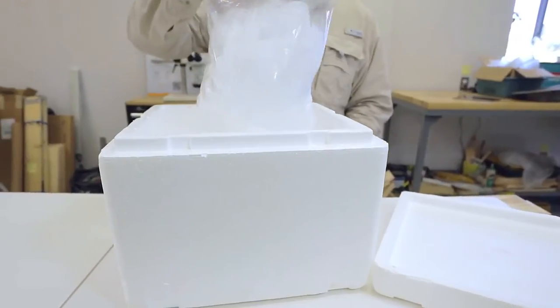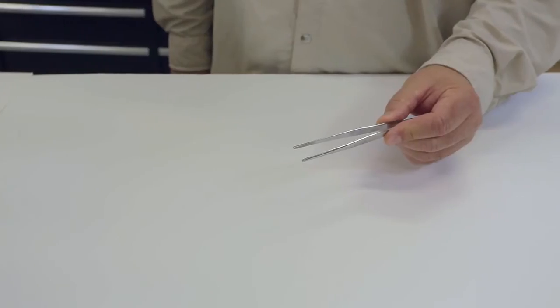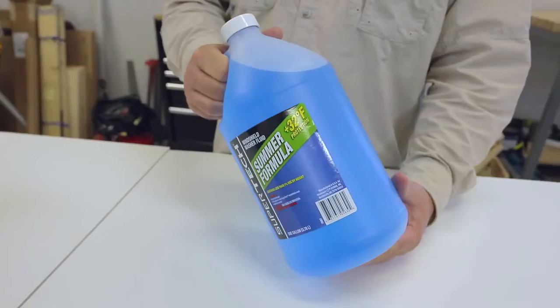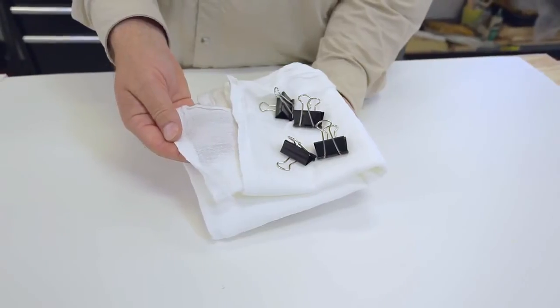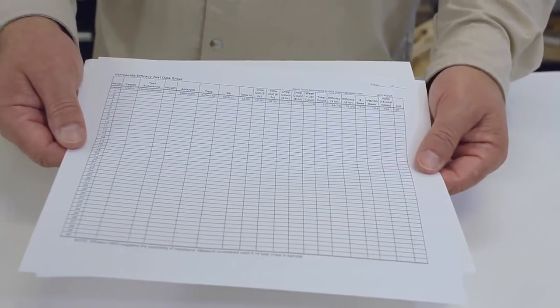You will also need a cooler with ice, a stopwatch or timer, a cutting board or tray, forceps, a marker and pen, a wash basin, washer fluid, a strainer, cloth, quart-size zip-seal bags or other suitable containers, and finally data sheets.